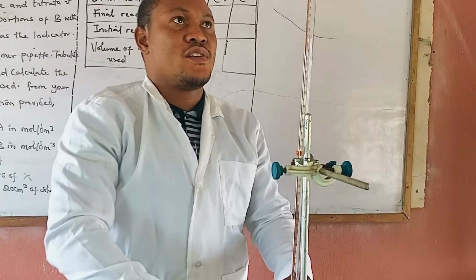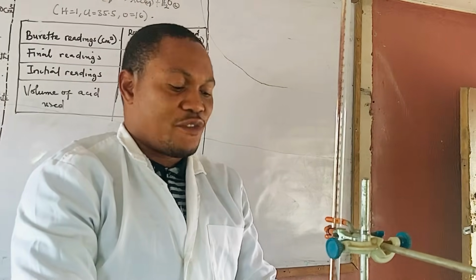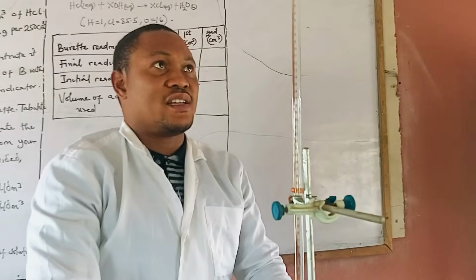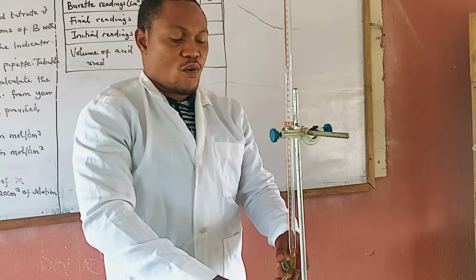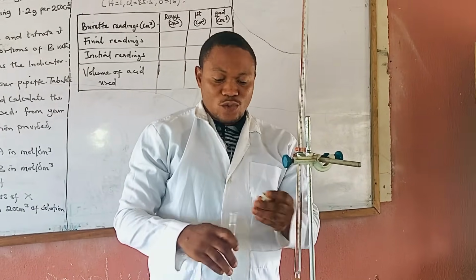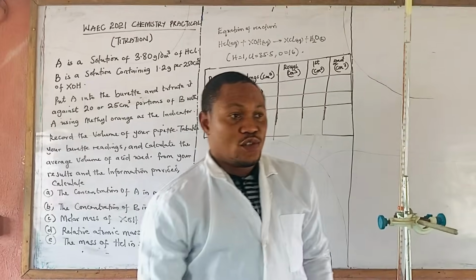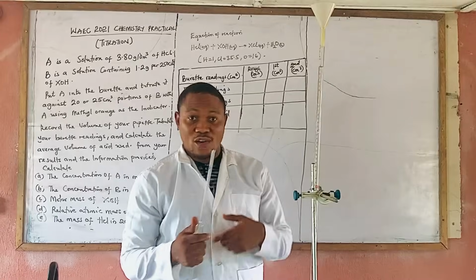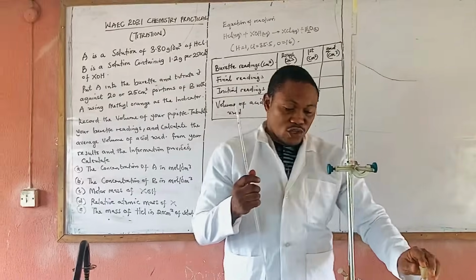Of course, the precautions have been taken care of, because before I refill, I've actually washed the burette. If you don't understand the precautions, you can check my previous video for the NECO practical. I'm going to wash this with water, then wash with the solution it is going to hold, which is the acid. Your pipette too is going to hold the base. We have washed that with water and also with the solution it is going to hold, which is the base.